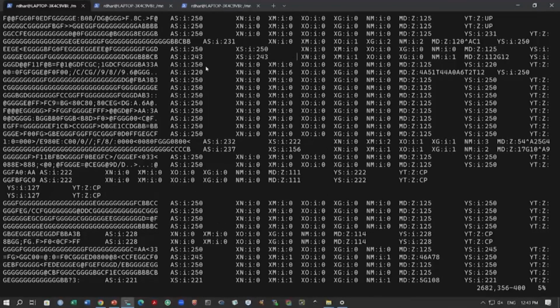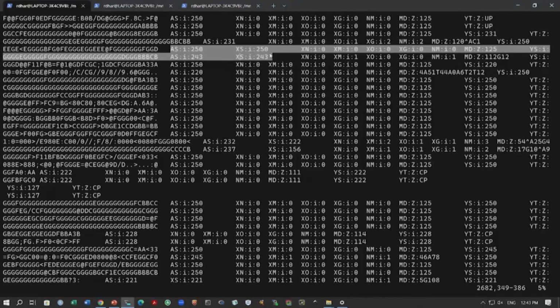Okay. And in some cases, for some reads you can see this XS field, right. So, you have this AS:i, XS:i, and in this case what you see is that the alignment score and the alternate alignment score are actually the same. Okay. And in these cases you would have to be careful, because this means they are mapping to repeat sequences, right, and the alignment score is exactly identical. So, that means they are probably showing exactly the same alignment. It is not like one alignment is better than the other, they probably have a similar number of mismatches, etc.